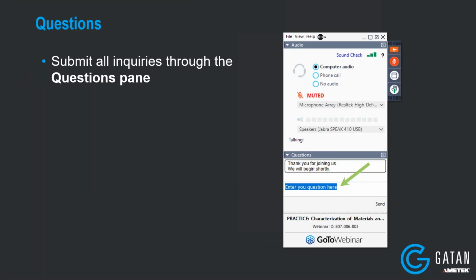Yeah, so for these experiments, I think I used several different cameras to collect the data that I showed in this presentation. I used the Metro, which is a direct detection counting camera. I also used Stella, which is a hybrid pixel detector based on Dectris's ELA camera.